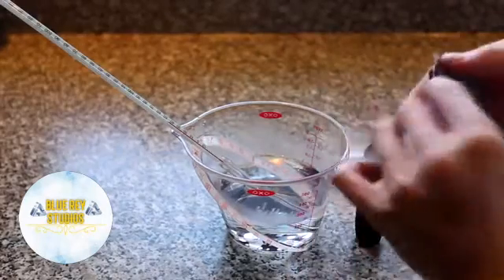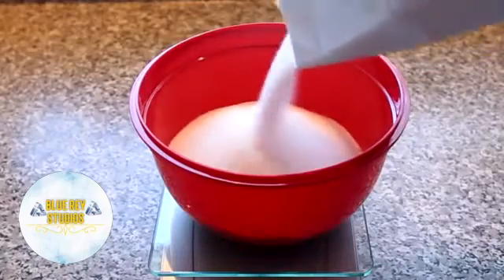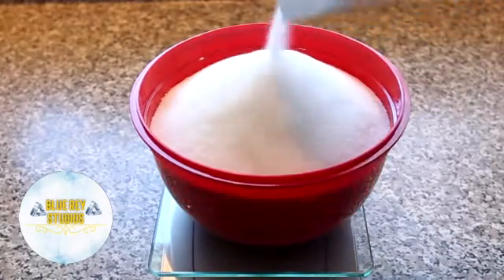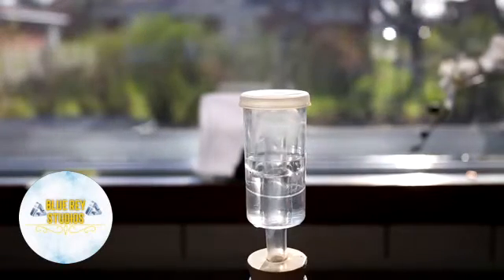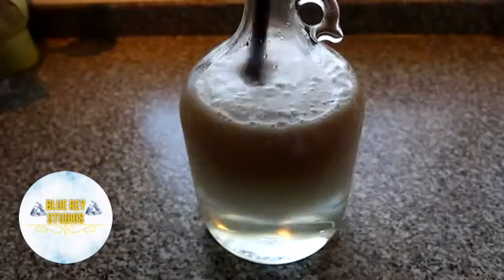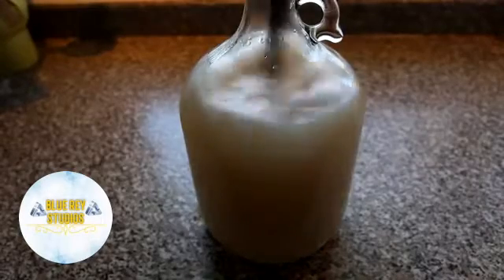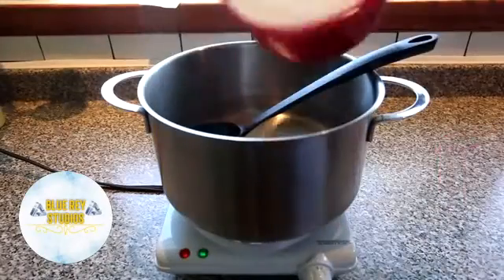In this video, I'll be showing you how to make ethanol by the fermentation of sugar. This method is extremely similar to brewing wine or beer, but it differs in several ways. The process is tailored to gaining the most ethanol possible with the fewest contaminants and in the least amount of time. You can drink the ethanol that is produced, but even if you clean it up with activated charcoal, I don't think it's going to taste very good.